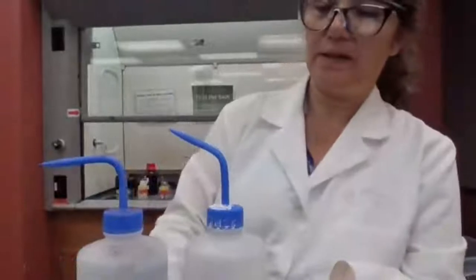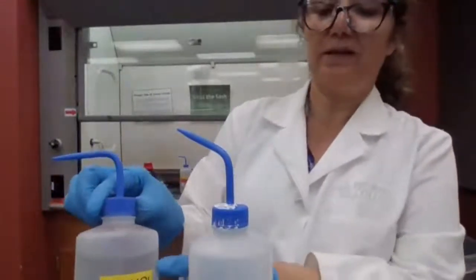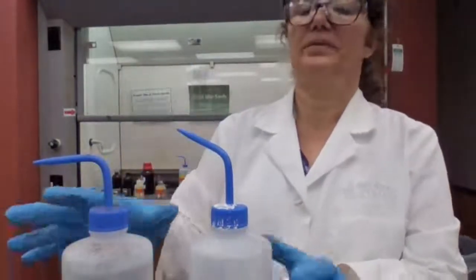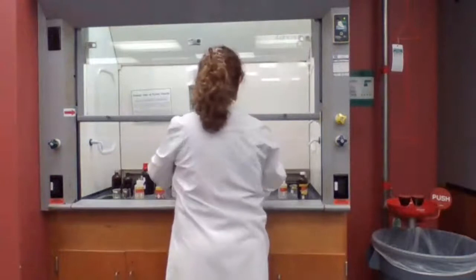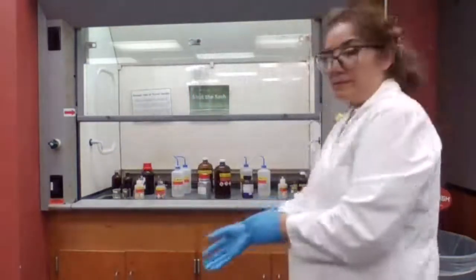As long as you know the amines dissolve in HCl, they don't dissolve in sodium hydroxide unless it's less than 5 carbons. Okay.